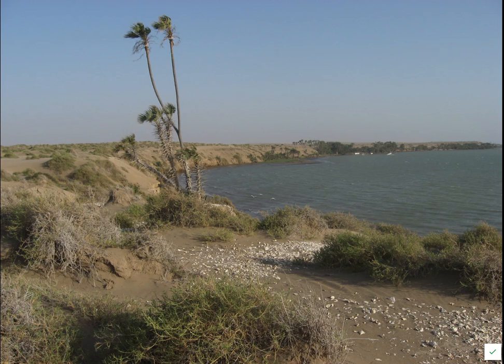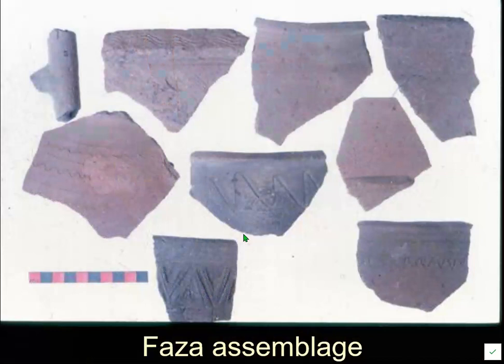And I looked at some of the pottery of the 9th century, the same time they were making pottery in Zabid, and I found that it was filled with large rounded grains of sand, which is not like the finer angular sand that you would get at Zabid and the other sites. And so I took it back and thin sectioned it and found it was a very interesting, even greater diversity of inclusions because the longshore drift had brought sand up along the beach for miles down the coast. So it was really quite distinct from the other sites.